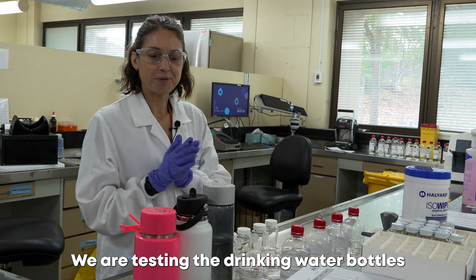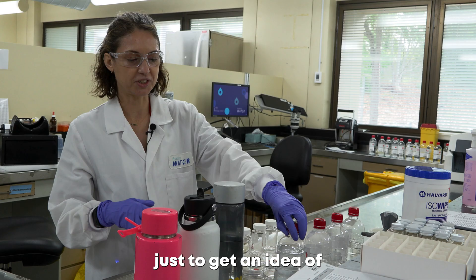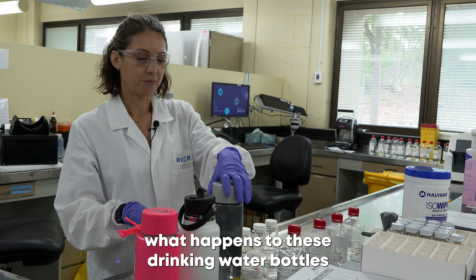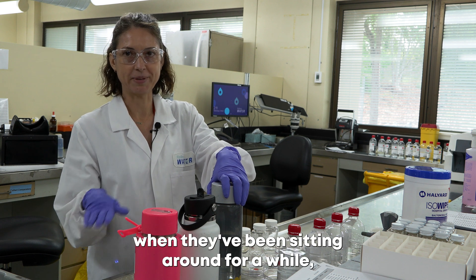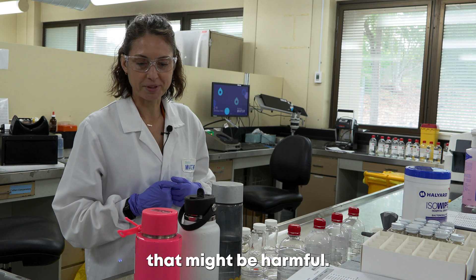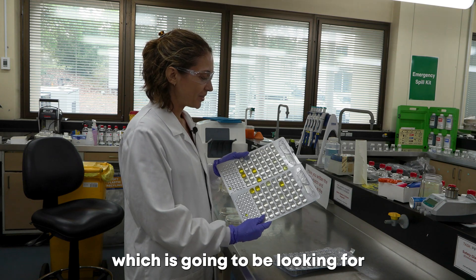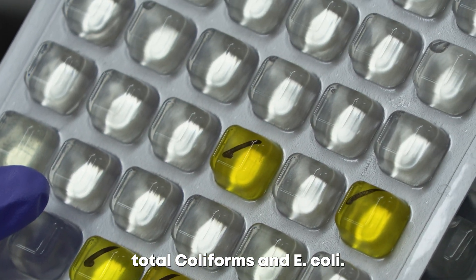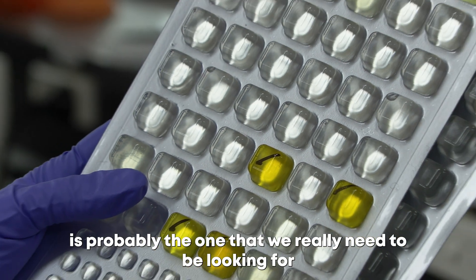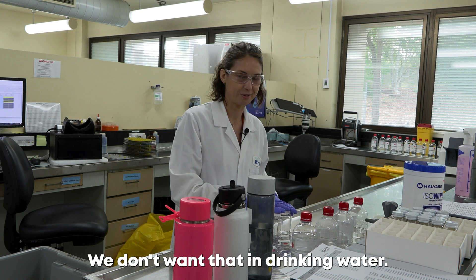We are testing the drinking water bottles we've got here against plain drinking water, just to get an idea of what happens to these drinking water bottles when they've been sitting around for a while — if they accumulate any bacteria or anything on them that might be harmful. The tests we're going to be doing include a coli-lert test, which is looking for total coliforms and E. coli. E. coli is probably the one we really need to be looking for — it's very harmful to people and we don't want that in our drinking water.